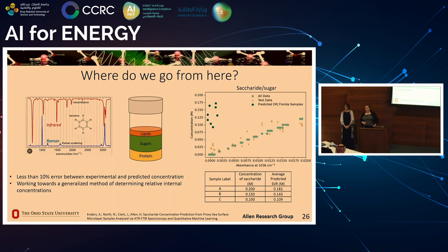That idea came up when we originally thought about this. The initial thought was looking at one model that would be able to look at all the functional groups at once and maybe give you a statistical likelihood that that functional group is within the molecule. I think what we ran into when we tried that kind of regression-based approach with our current data is the data disparity in how many representatives we had for each functional group. There would be a lot of functional groups that would never actually get selected by that model, due to the fact that we had 2,000 of this one and only like 43, for example, of acyl halides. And I wasn't sure of a way to better scale that data to make sure that we weren't just accidentally kicking out a likelihood that that functional group showed up in the NIST database as opposed to in that molecule specifically.